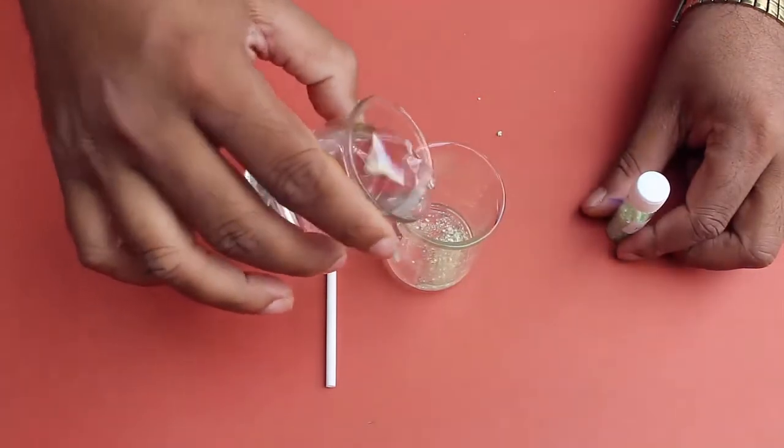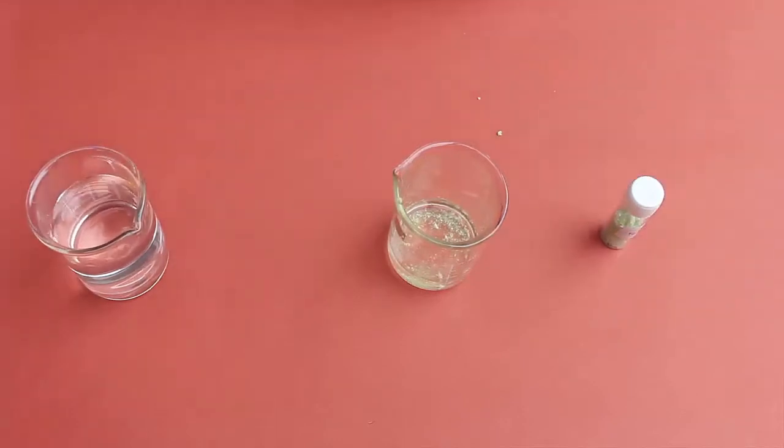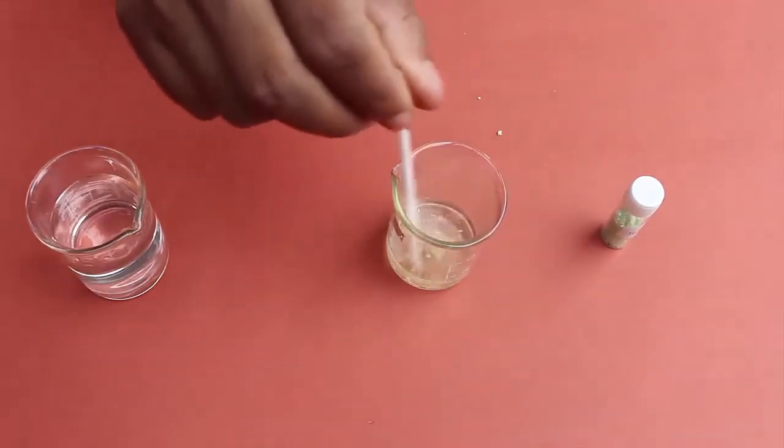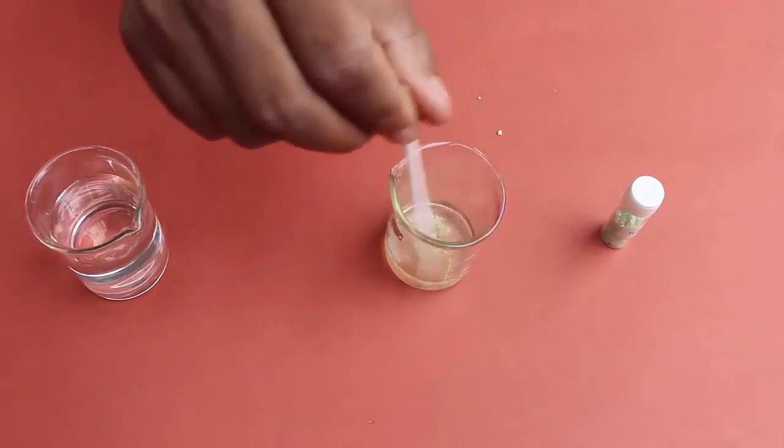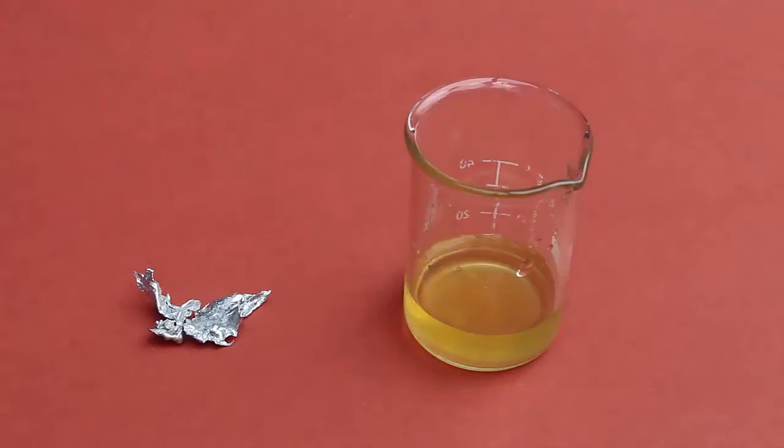After a little while, you will get a clean solution of ferrous sulfate. This solution will be slightly pale yellow in color.